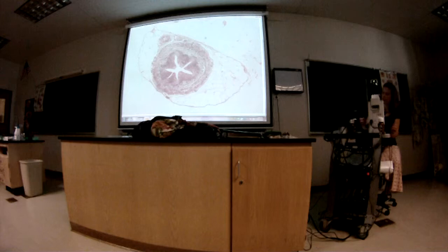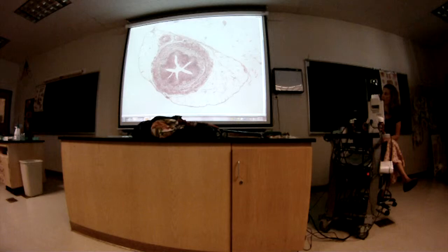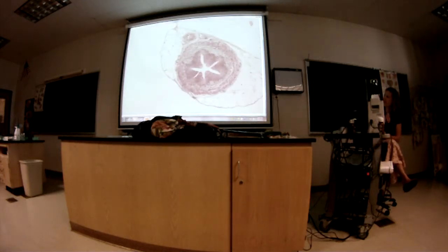Alright. Tell your neighbor, what is that organ? Ureter. Yeah, I heard it. Ureter? It's a star.